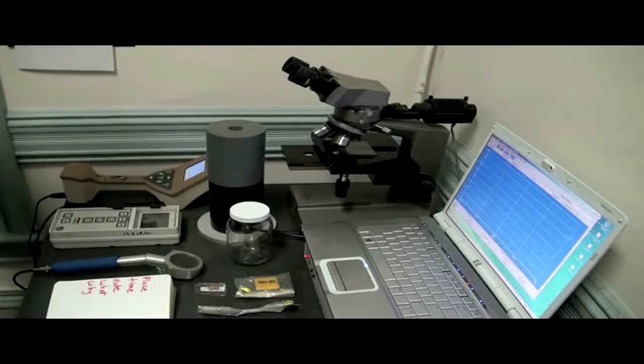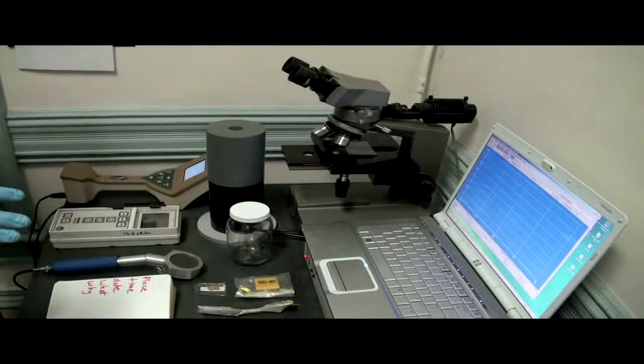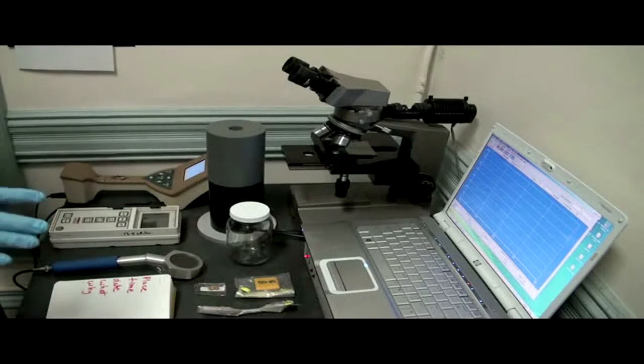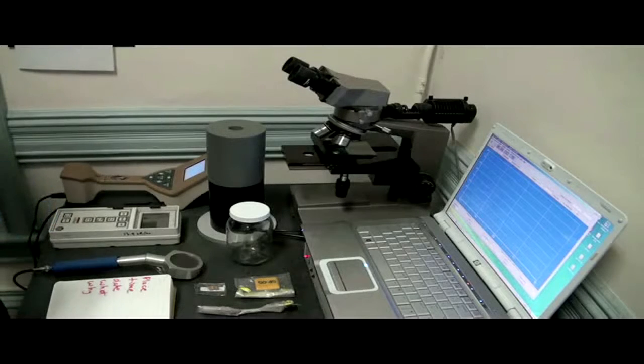The second thing that we do is we try and take multiple measurements. Whatever we're doing for radioactivity, we'll do it three times. That way we'll see if whatever number we're getting is different, is changing because of random error or it's really changing because of something that's happening with your samples.